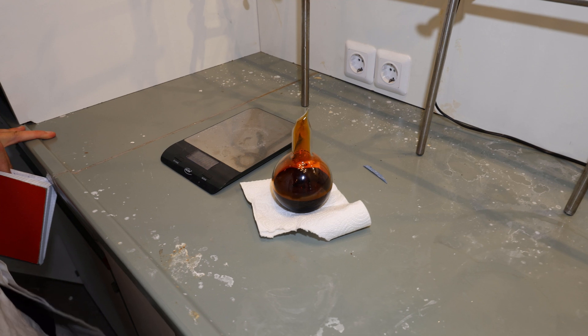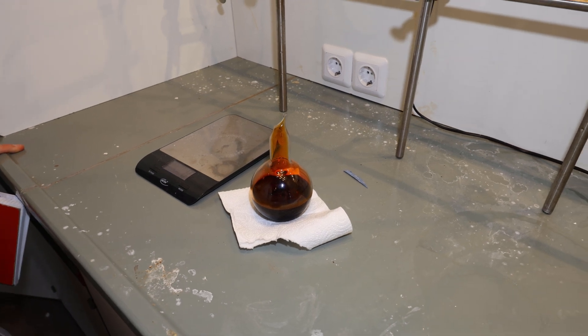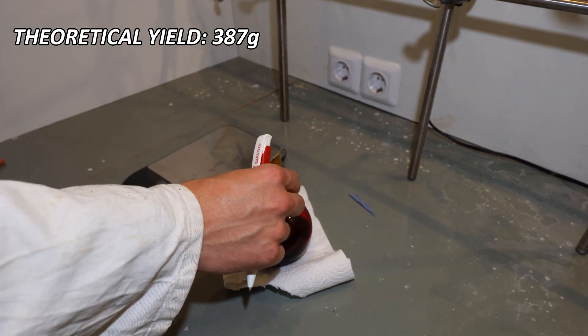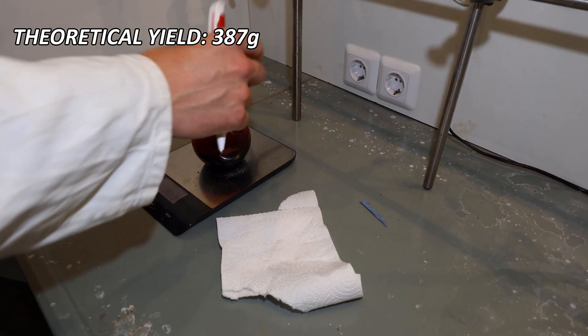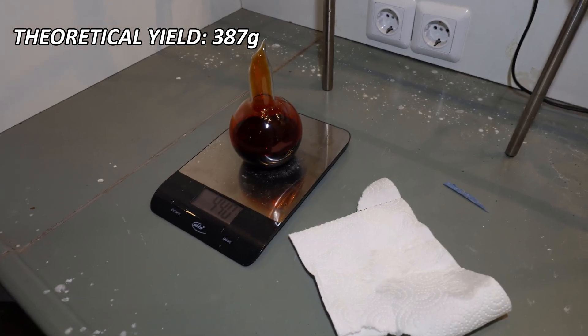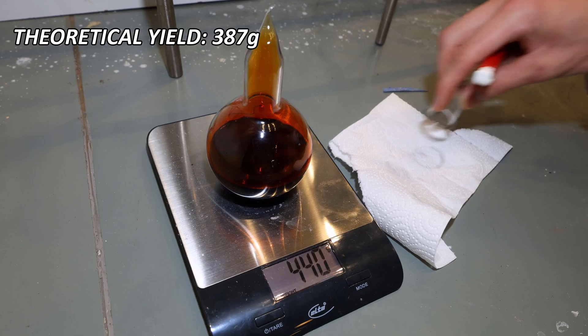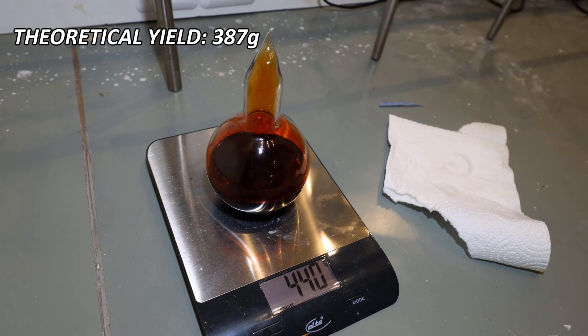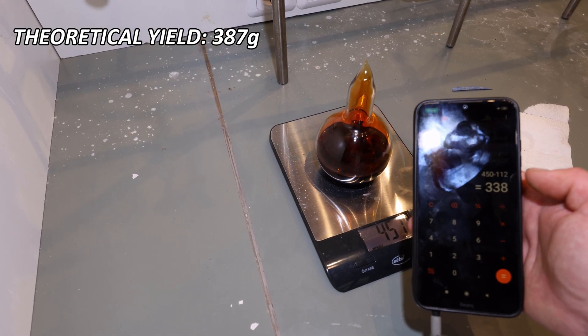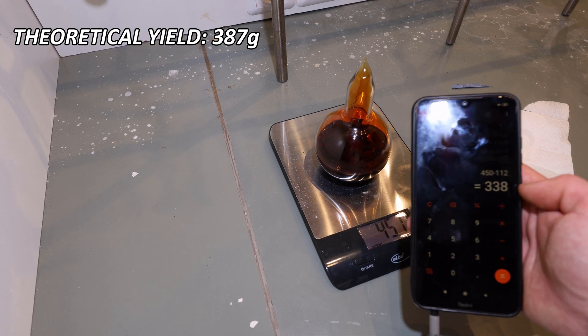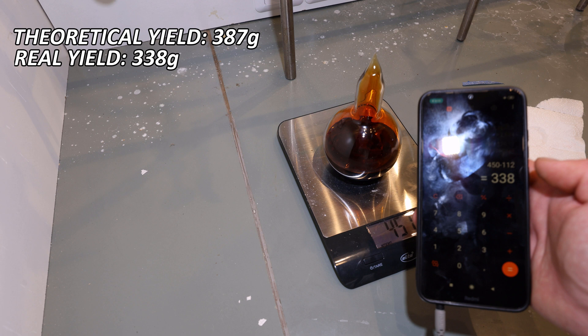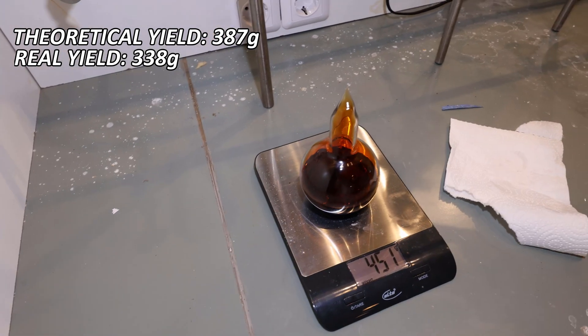We expect the yield of 387 grams. Let's see how much we got now. How much is the flask? The flask is 112 grams. So we have now 338 grams of bromine.